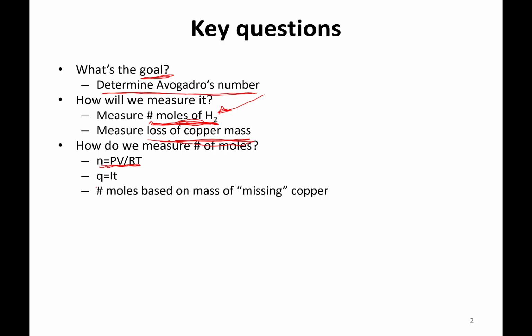We're also going to use an equation because we're going to tie this all into the number of electrons that are generated in our reaction, or a number of electrons really that are moved from copper and into hydrogen ions. So we're basically losing electrons in the copper. That's an oxidation process, and we're gaining electrons as we go from H+ into hydrogen gas.